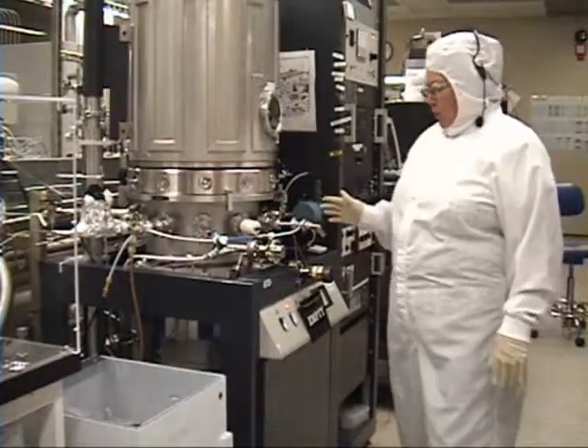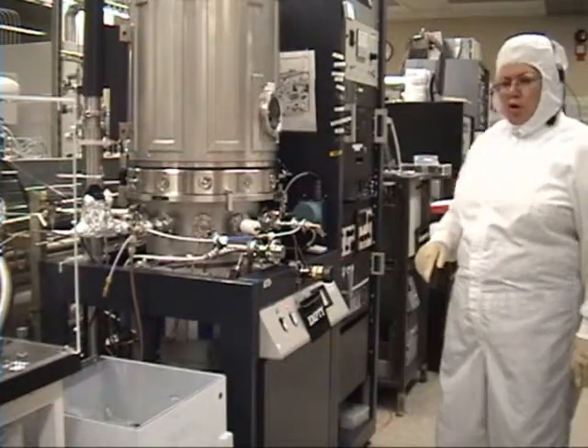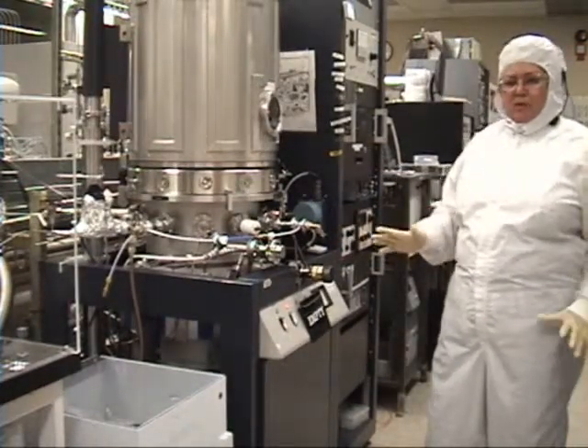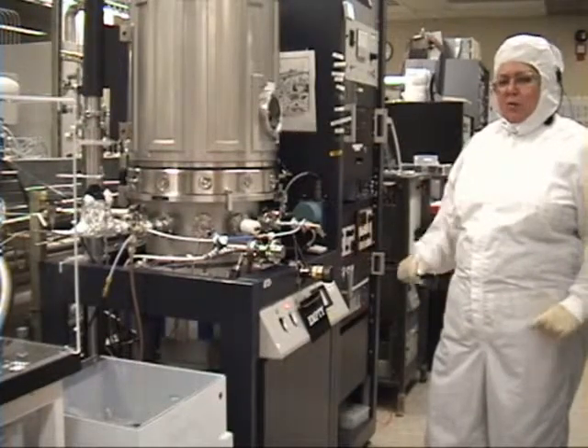Hi, my name is Jeannie. I'm going to be training on Metallica. We're going to do some checks real close to make sure that the system is available in a manual mode.